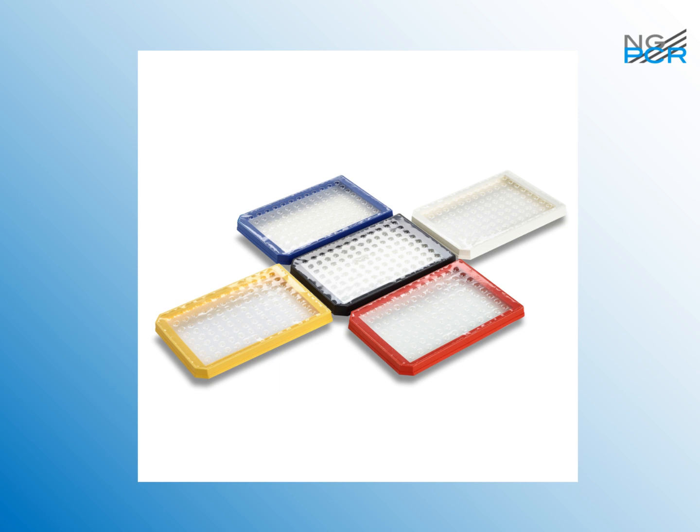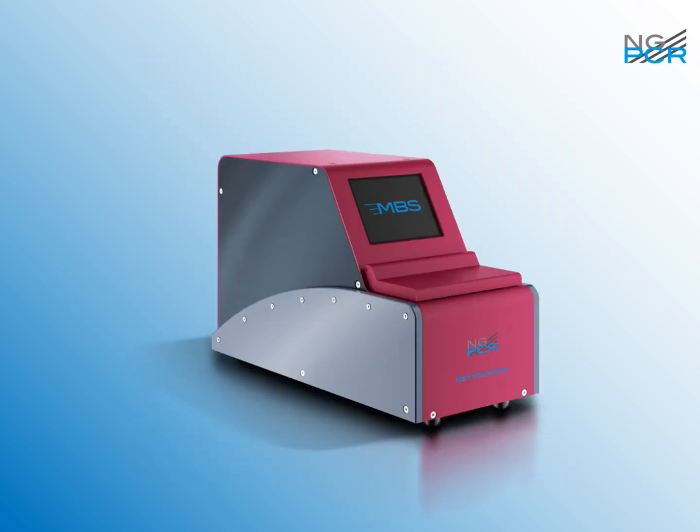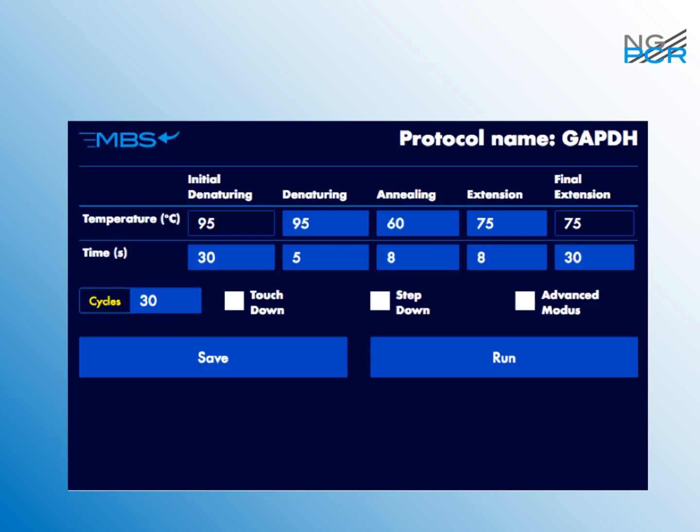And then we put them in this machine. And the machine cycles the plate between zones. In a few slides down, I will show you exactly how this cycling between zones works. So far, this is all pretty simple, right?